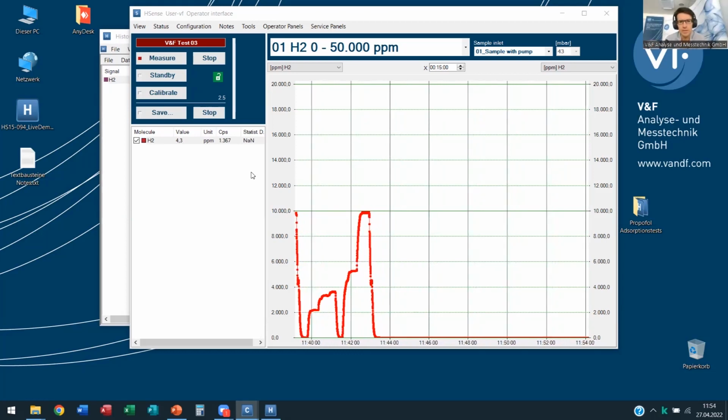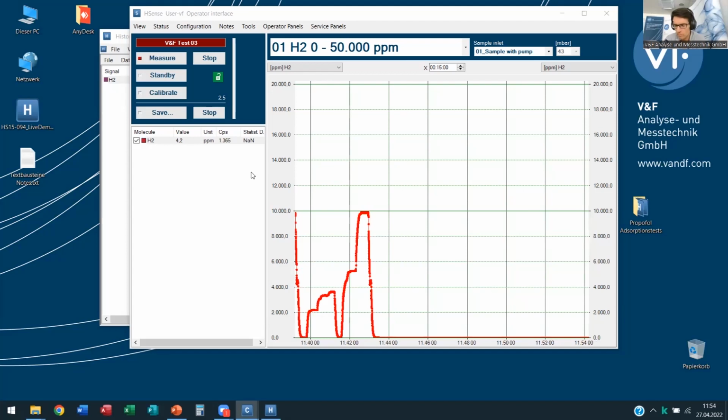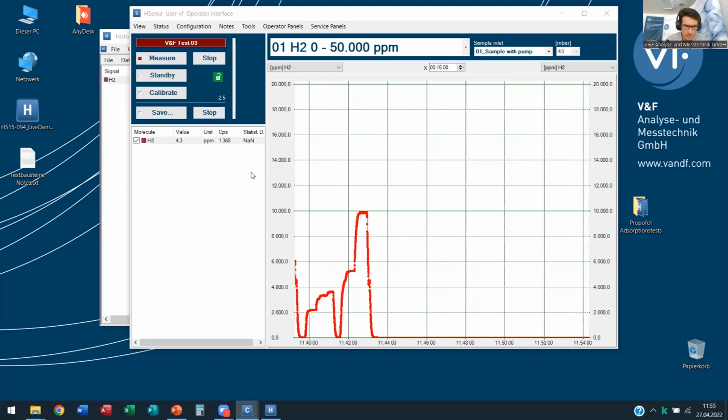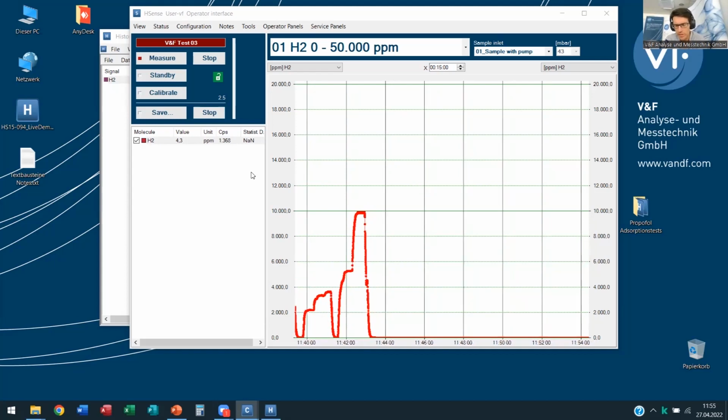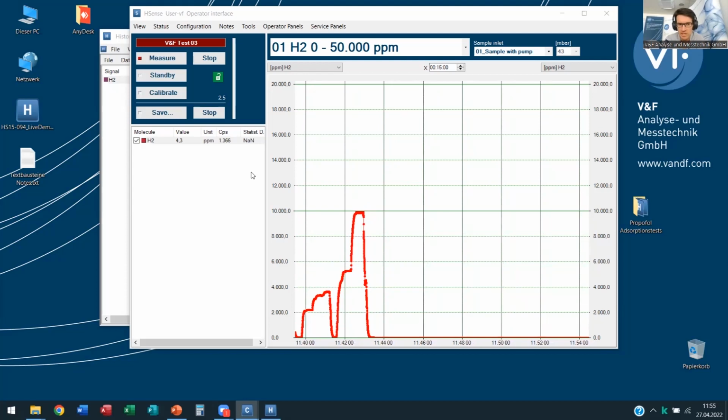Usually the parts of the instrument that become dirty, as you've mentioned, are typically the sampling lines. We don't have an option to purge out this kind of contamination, because the soot contamination from typically combustion engines is not something that is easily cleaned.